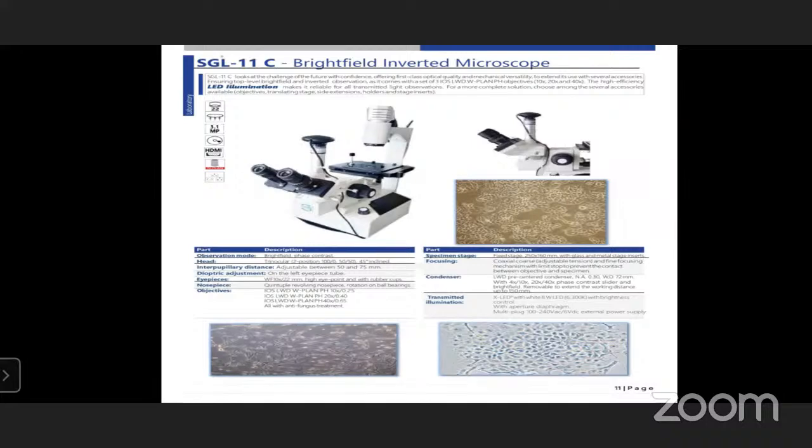So on the stage, you have to directly place a plate or particular evacuated bottles, culture bottles, or the vials, whatever you have to place on that particular stage and directly observe under the microscope. So here I have given three images which are captured from the devices.